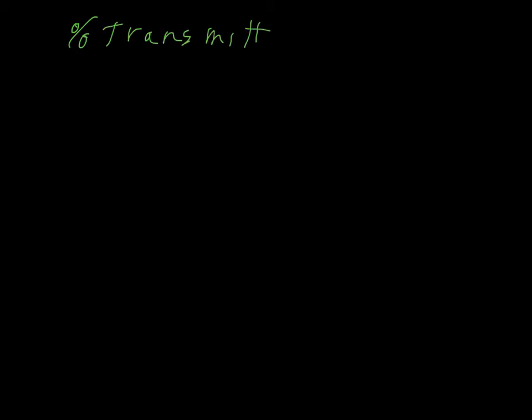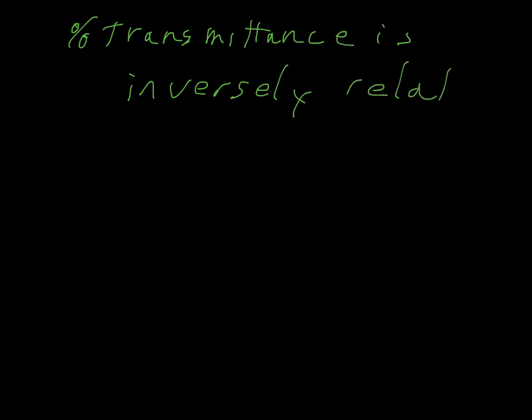Percent transmittance is inversely related to concentration. Now, as chemists, do we like inverse relationships? No. We like direct ones.